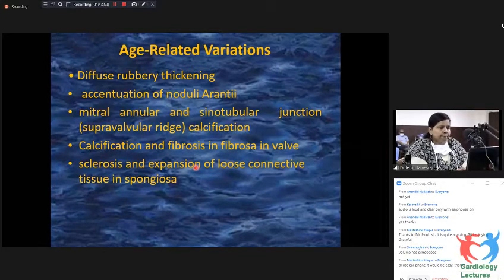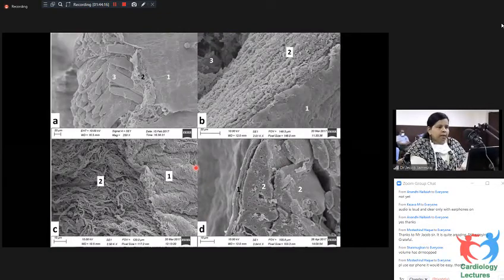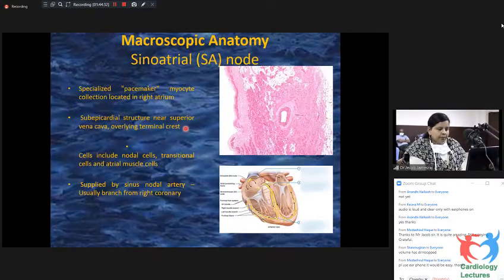Coming to age-related variations, brown atrophy, there is lipofuscin pigment that increases with age, and also the proportion of the cytoplasm is more in adults; in the infant it is much less. Also, there is some perivascular collagen around the blood vessels, and the papillary muscle fibers can have some fibrosis near the chordae tendineae. You can see this pale pink material is a fibrous structure.